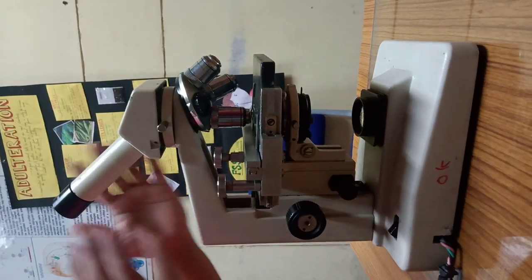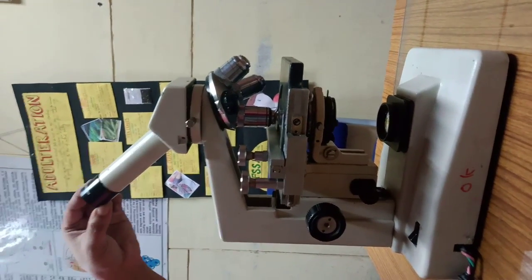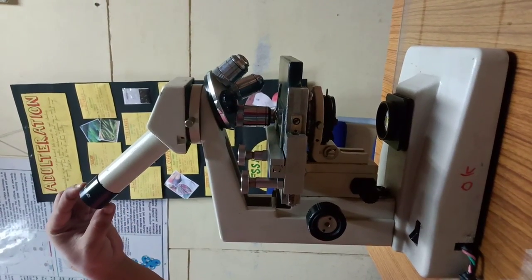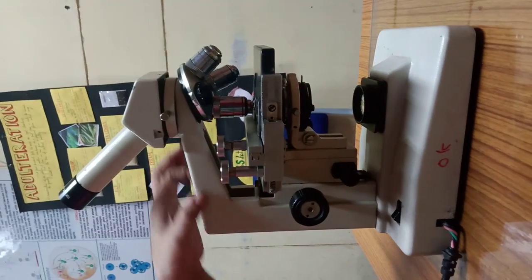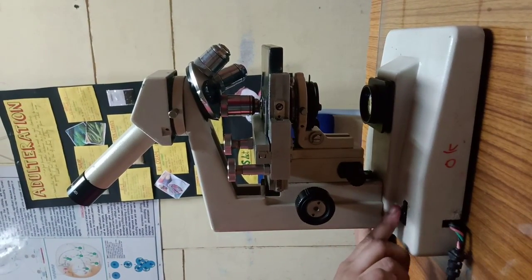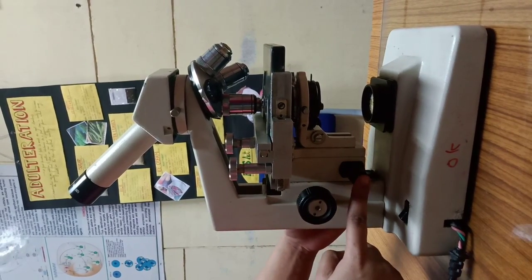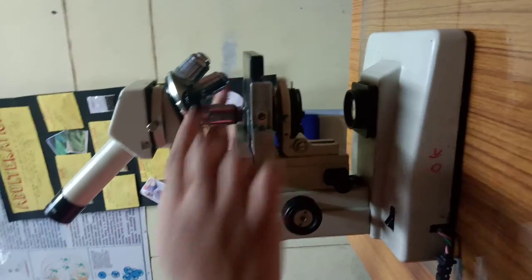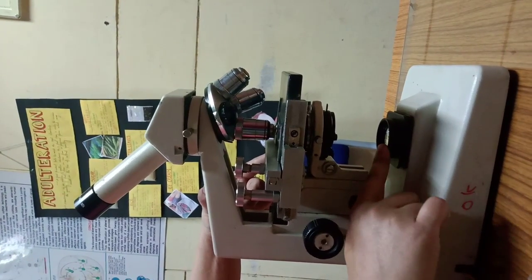Okay, so these are all the parts of the microscope. Before I end, I repeat. The parts of a microscope: ocular lens, eyepiece, body tube, neck, handle, base, electric supply switch, coarse adjustment knob, fine adjustment knob, stage clips, diaphragm and condenser, light source and the base.